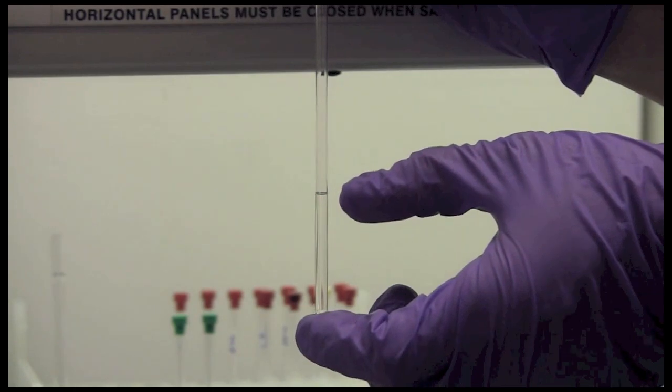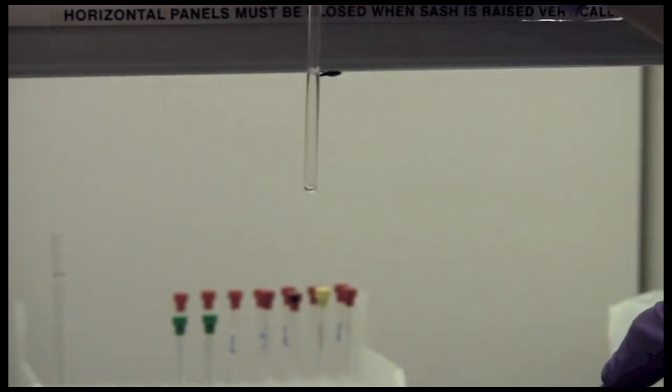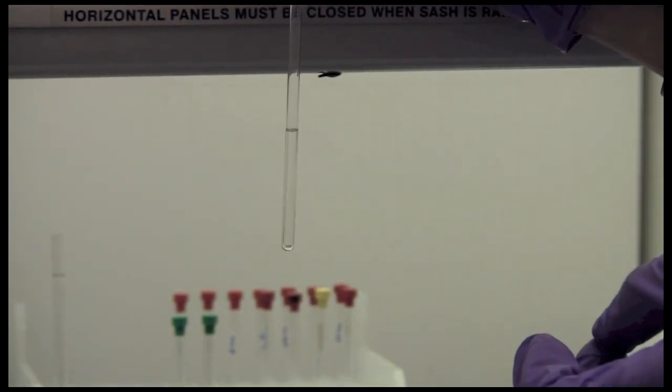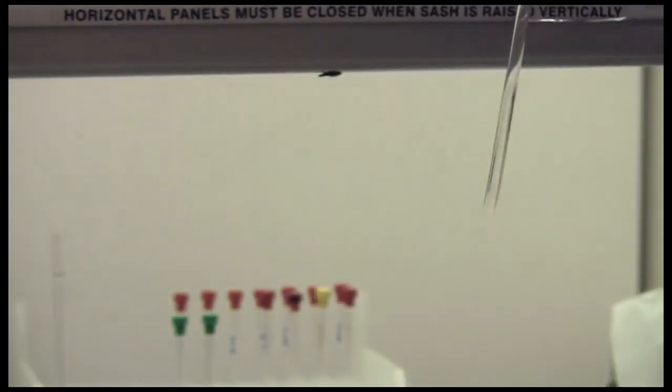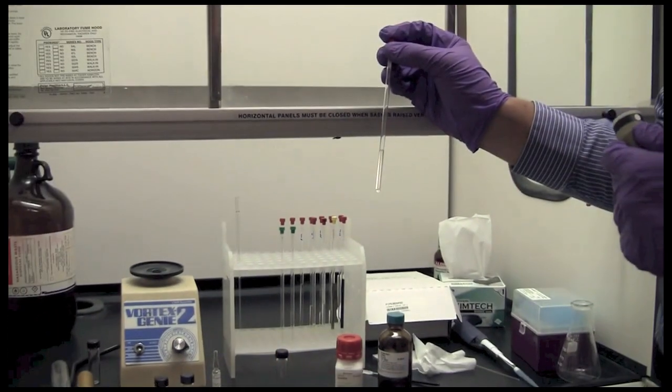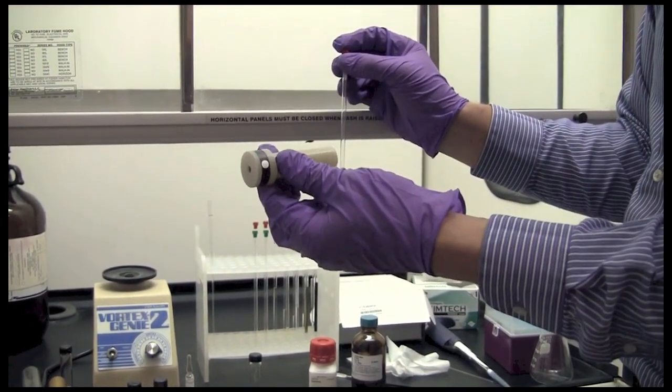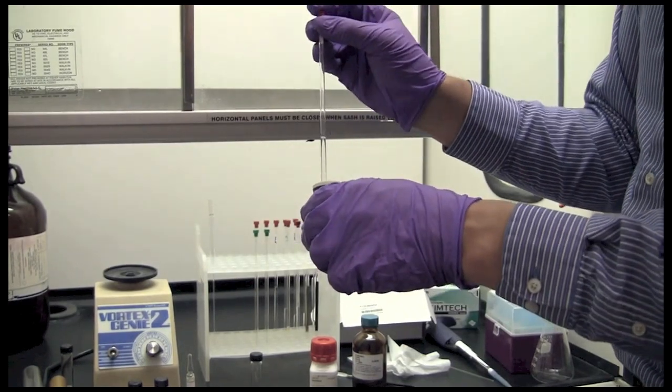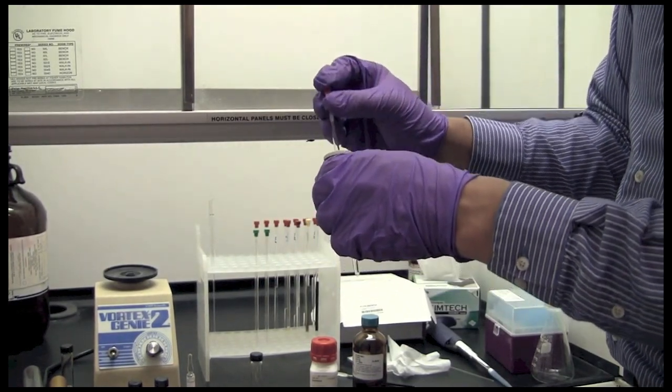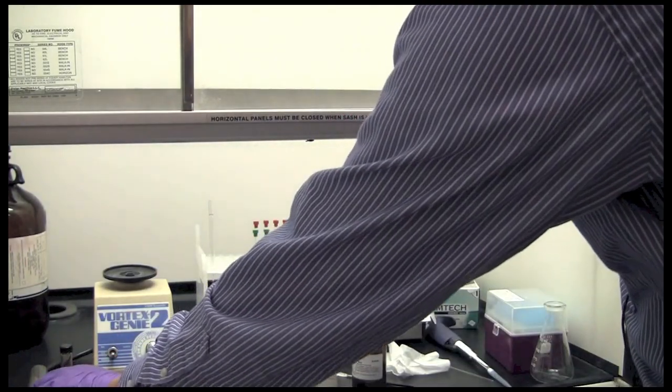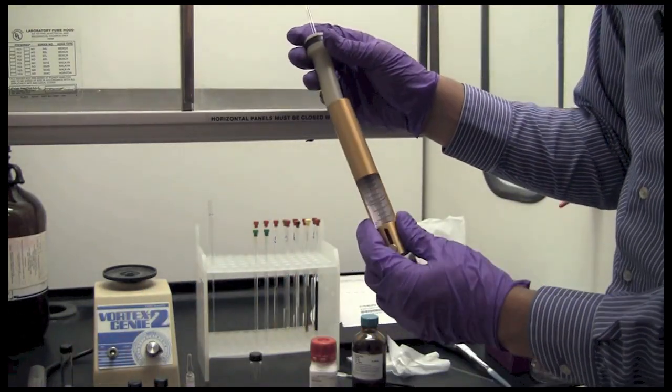About three to four centimeters is a good amount. The reason we need this height of sample is that we want the ends of the sample to be far away from the detection coil. So to see what I am talking about, I am going to put the sample into a spinner. In this case this is a Varian spinner. So I will put the tube into the spinner and then put it into the depth gauge to properly adjust the height.